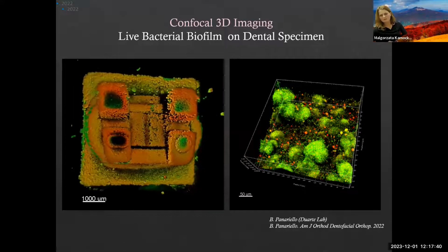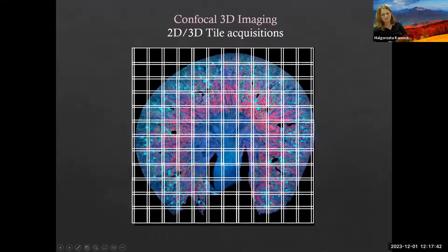And then I wanted to show you an example of large-scale imaging. So as I mentioned earlier, having only a single field, a representative single field, sometimes it's not really very helpful. So even if we collect several fields from the section of the tissue, it may not provide enough information. And also, we always select certain areas.